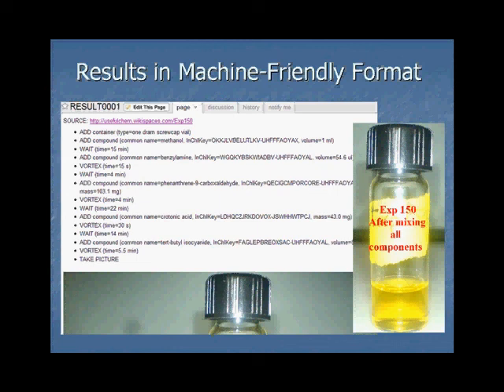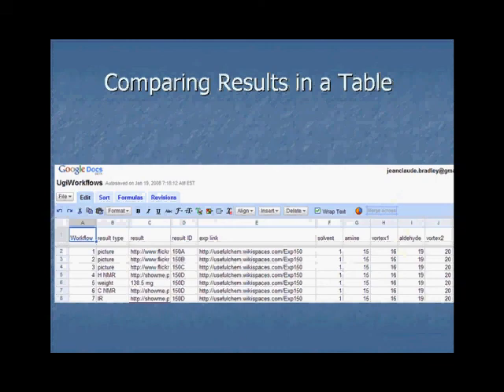So this, going forward, is going to be very important, especially as we start to gather more and more information. Looking at these results, we can also compare them. This is a little different from the table that I showed you earlier, where we're looking for precipitates or no precipitates. These are individual results from experiments that are stripped out and left to stand on their own. So we would mix compounds together, wait 4 hours, and then take a picture. That's not the whole experiment, that's just the first data point. And then we would take it at 8 hours, and at 12 hours.